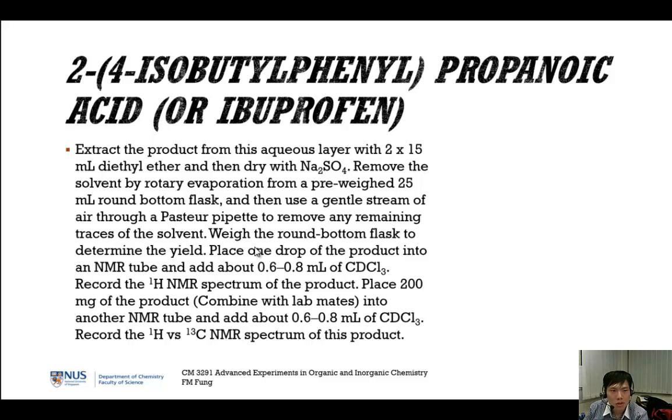After doing so, you place 1 drop of this product into NMR tube. You do an NMR analysis. This is the one that everybody must do, just like the first step. Okay. Right. This is for your own. We are doing a proton NMR for individual analysis.